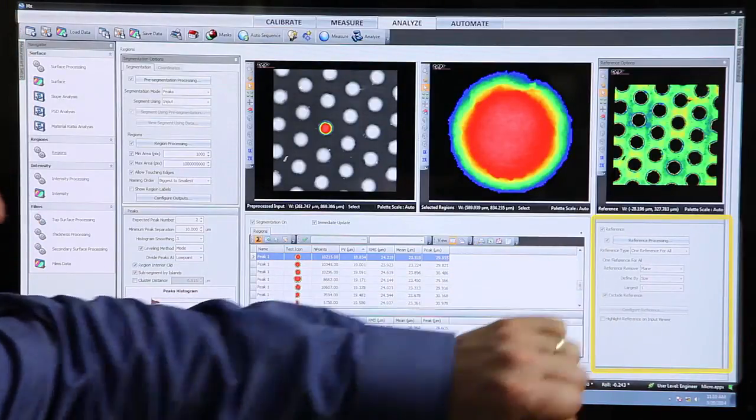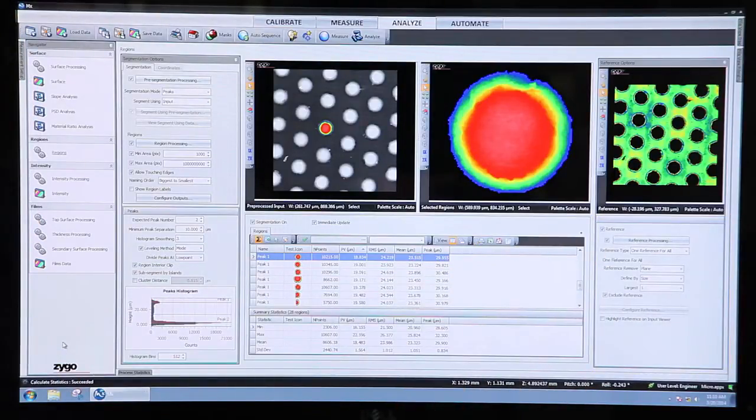And then on the right-hand side, underneath that reference map, we can separately process the reference map in order to provide a real clean reference for making good height measurements and segmentation of the individual regions.